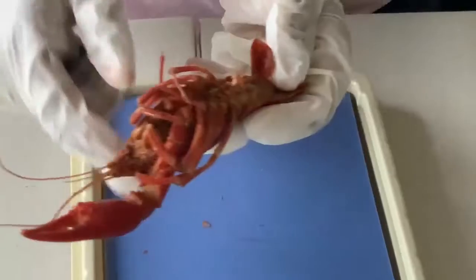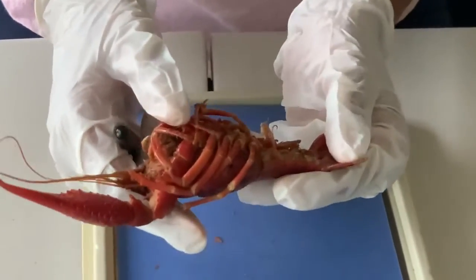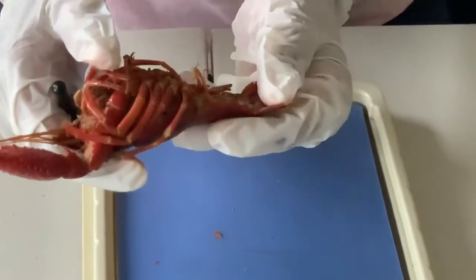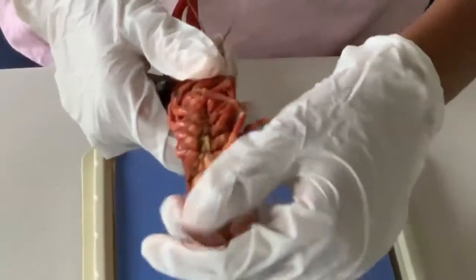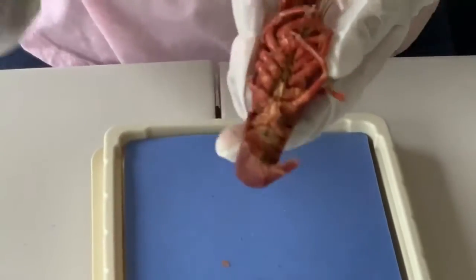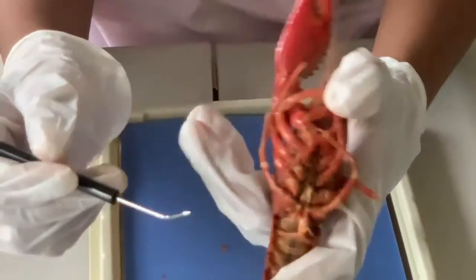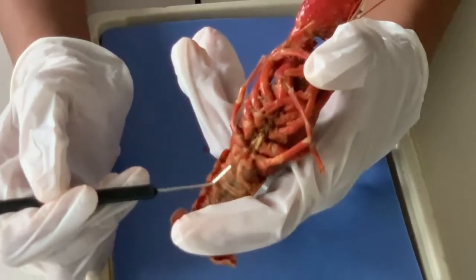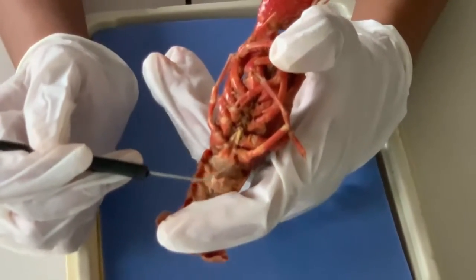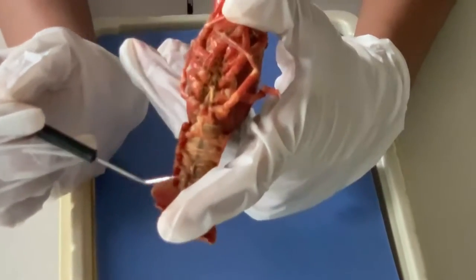So then comes the question: how do you determine if a crayfish is male or female? That's all based on the swimmerettes. My crayfish is male, and I know this because of the first pair of swimmerettes — in a male, the first pair is long and hard. However, in females, the swimmerettes are thin and feathery.